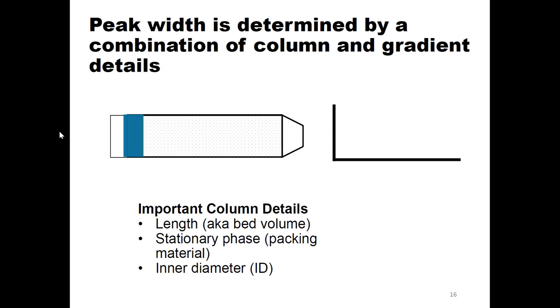So this is the physical setup of your LC system. And I know a lot of people feel more comfortable doing whatever everyone in their lab is doing. If everyone in your lab does a 20-centimeter column and has the liquid chromatography method that everybody recycles, I think that's usually the normal situation for a lot of labs. I know it was for mine before we started cracking down on that.